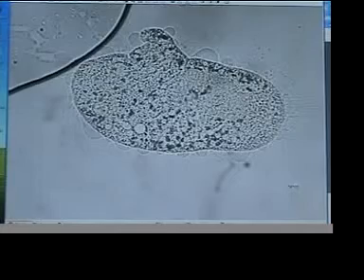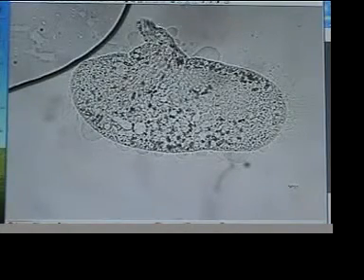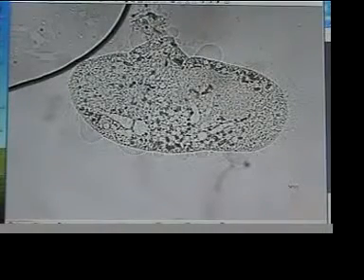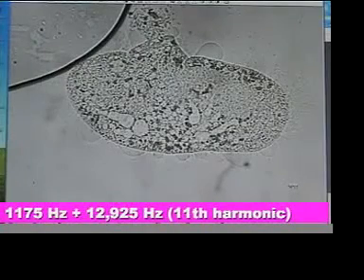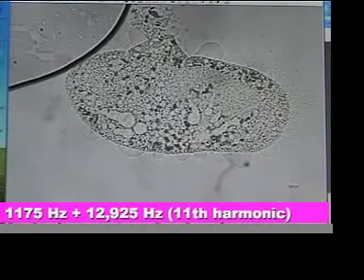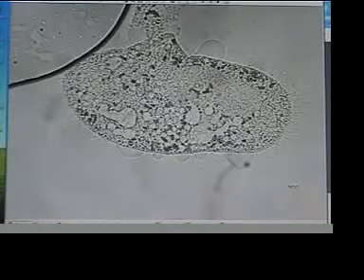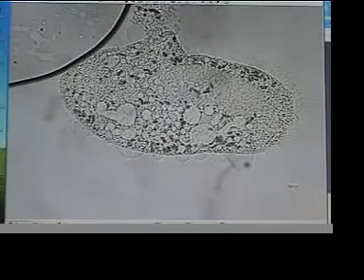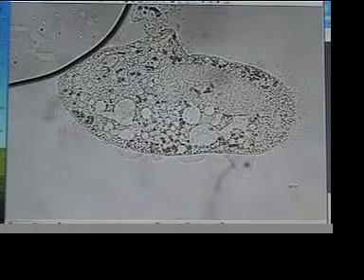Here's another paramecium undergoing destruction in real time, being hit by two frequencies, 1175 hertz and the 11th harmonic, 12,925. The power reading is about 110 watts, SWR 1.18. And let's watch him carefully.